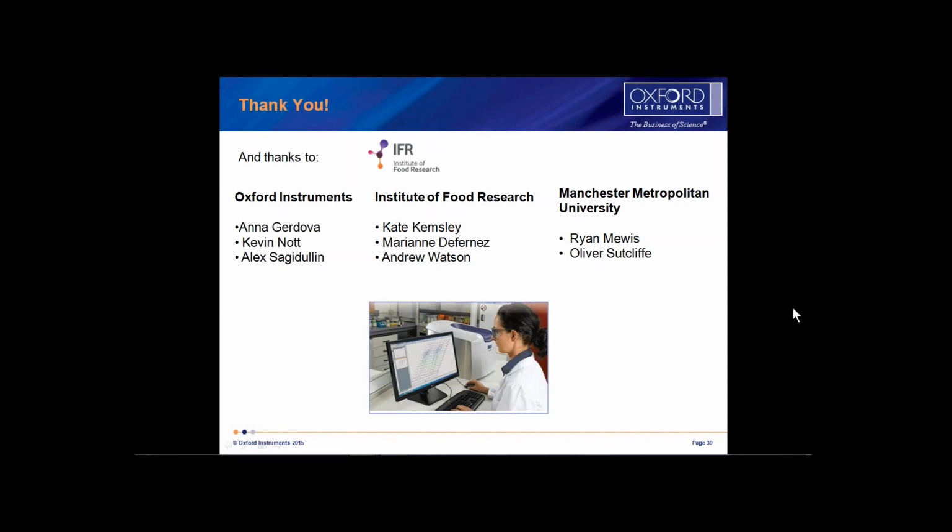What is a good sample concentration for 1H detection? The experiments that I showed here, especially the 2D, were all between 0.2 and 1 molar. But typically, we can collect a good 1D proton spectrum with about 20 milligrams of sample. To do the 2D would require a longer run because we'd need more scans.